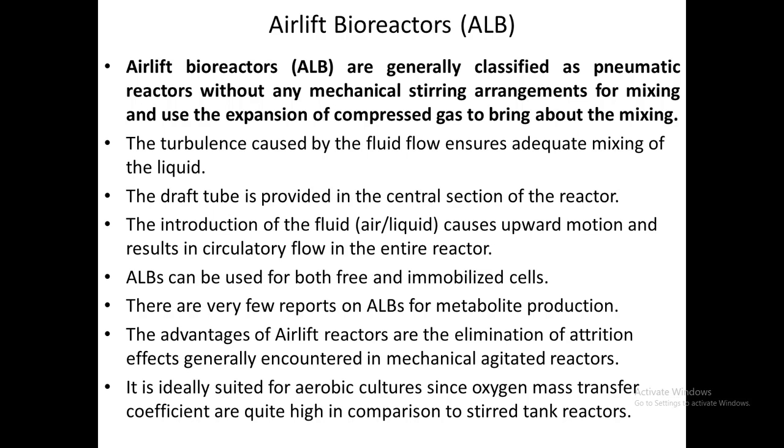ALB can be used for both free and immobilized cells. There are very few reports on ALB for metabolite production. An advantage of the airlift reactor is the elimination of the attrition effect generally encountered in mechanically agitated reactors.